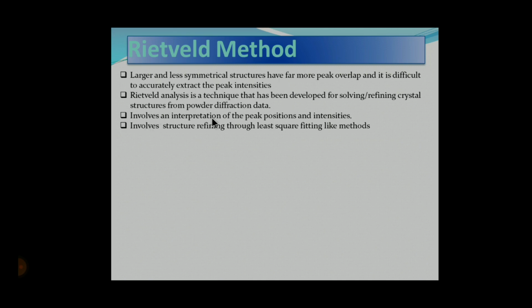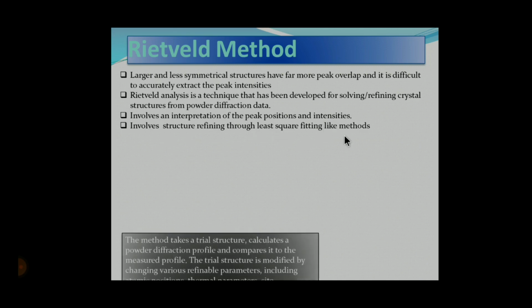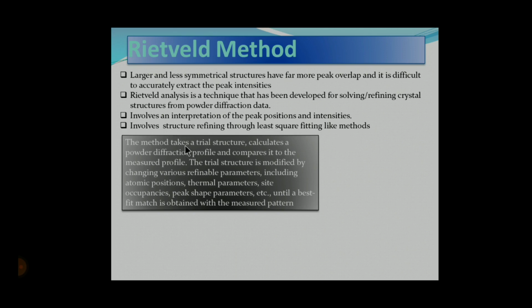So it involves an interpretation of the peak positions and intensities using a trial structure. This is how the method works: it takes a trial structure and calculates a powder diffraction profile.